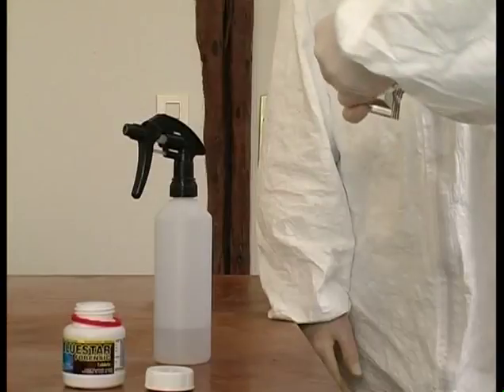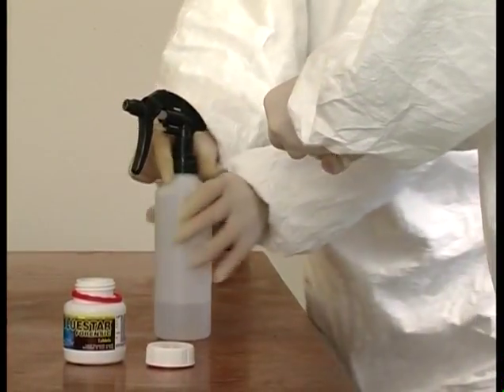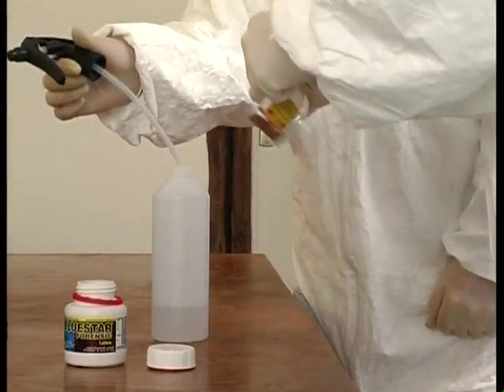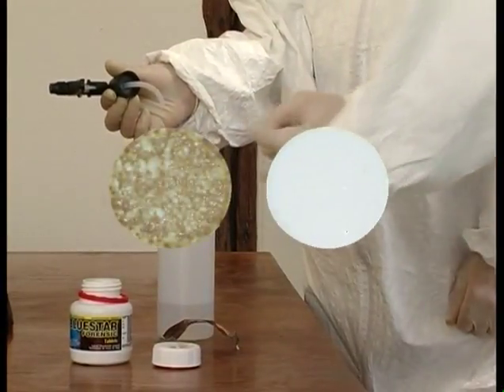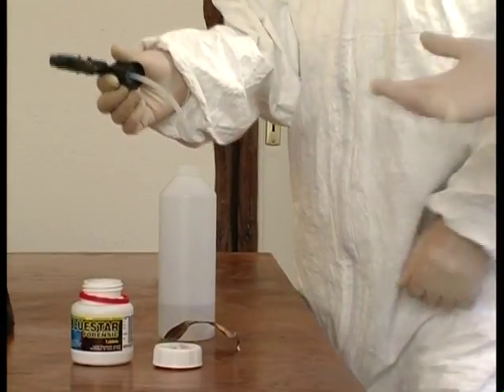The container holds four packets. Each packet holds a beige tablet and a white tablet. Let's dissolve these two tablets in 125 milliliters of distilled water.